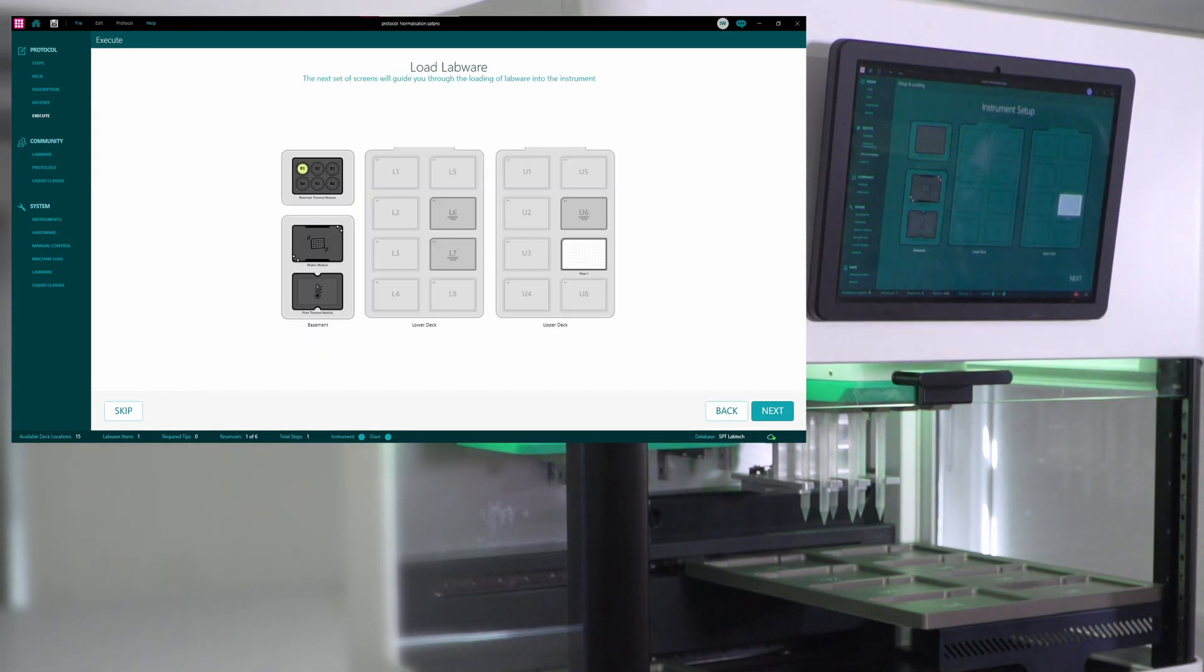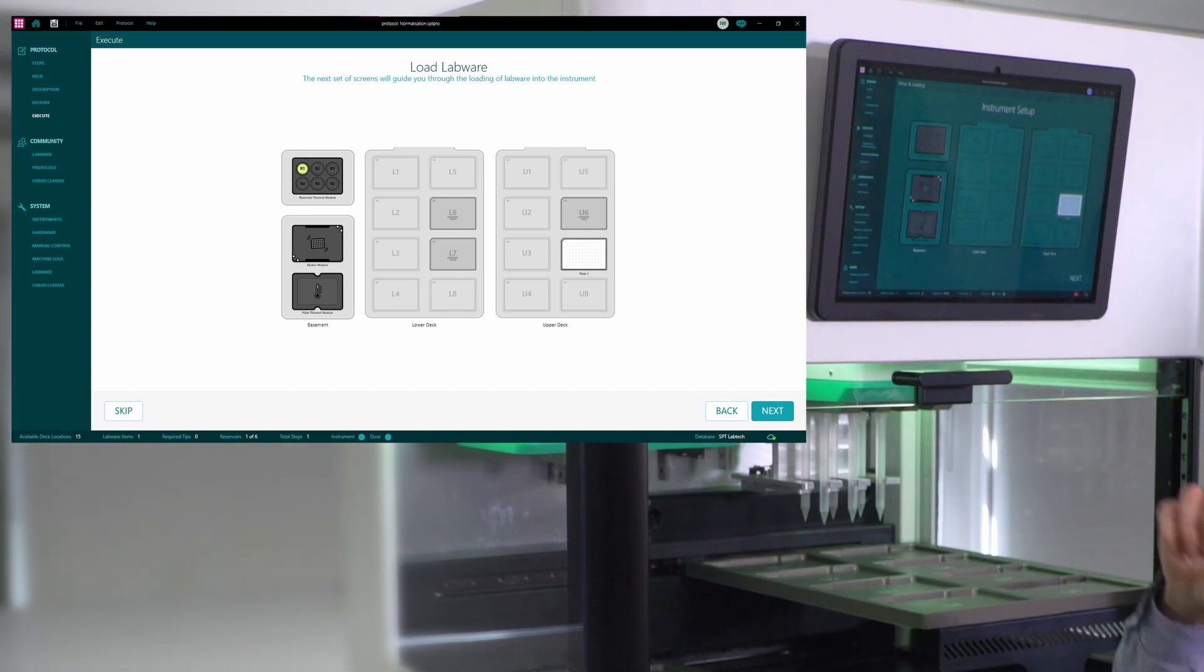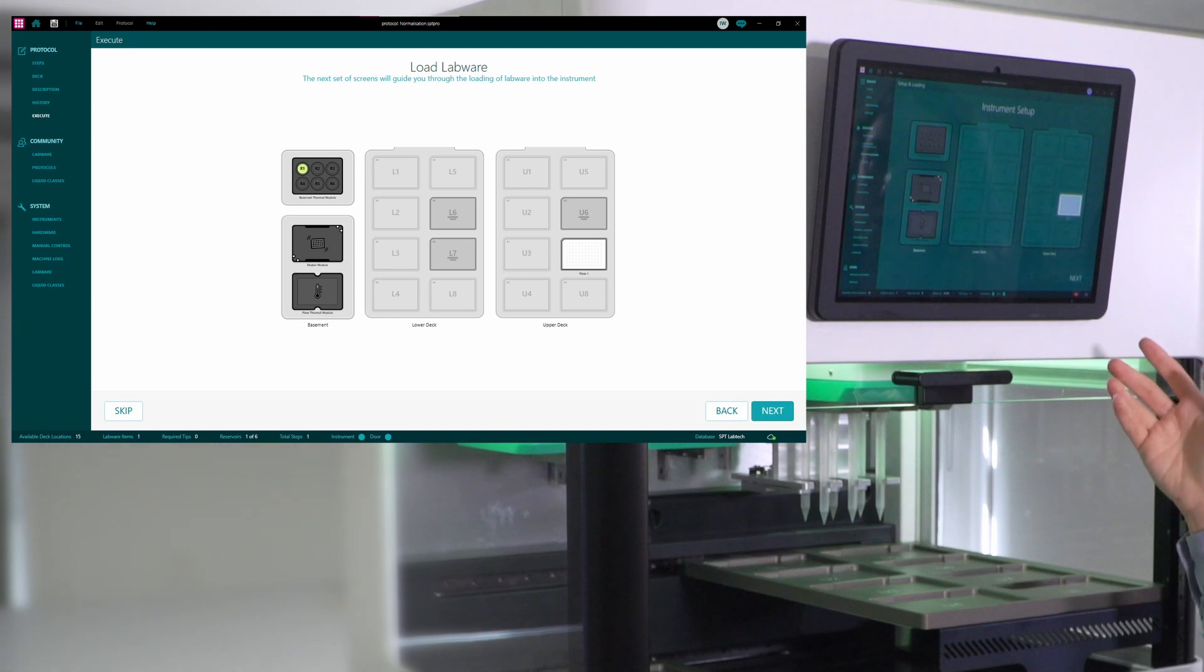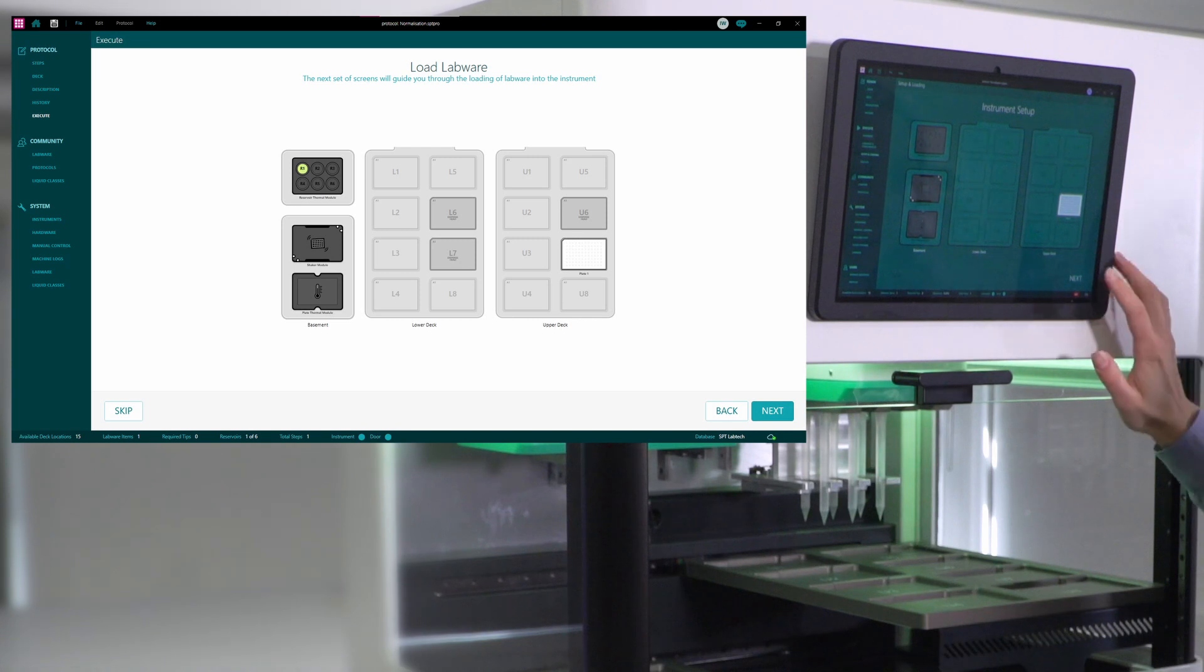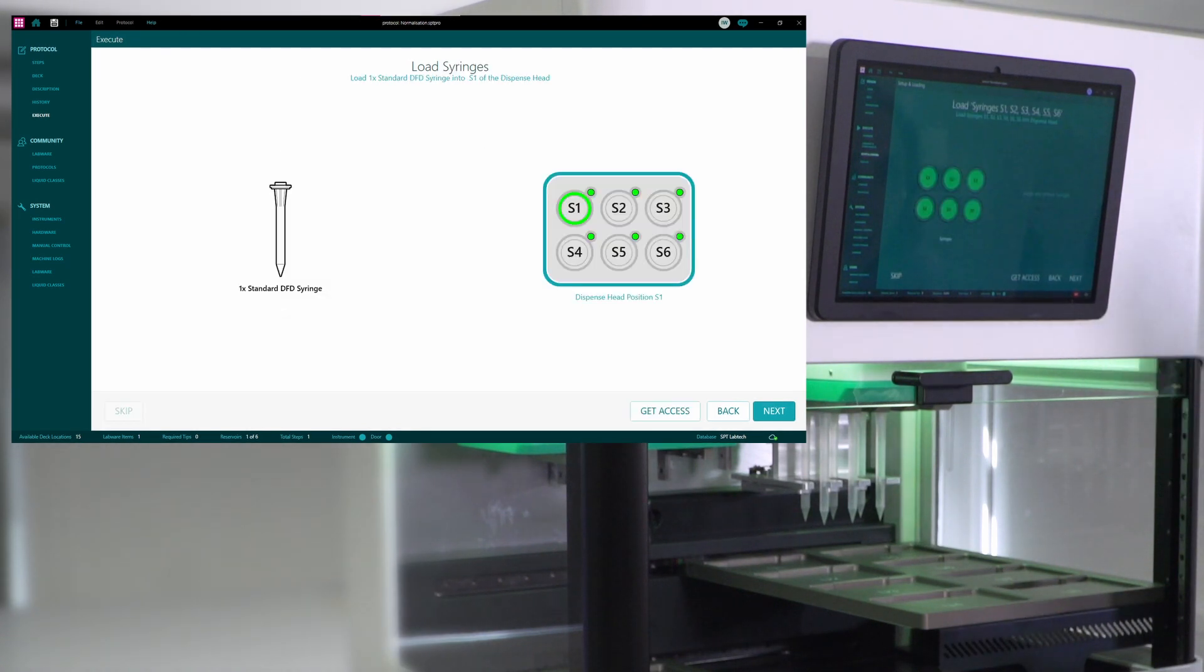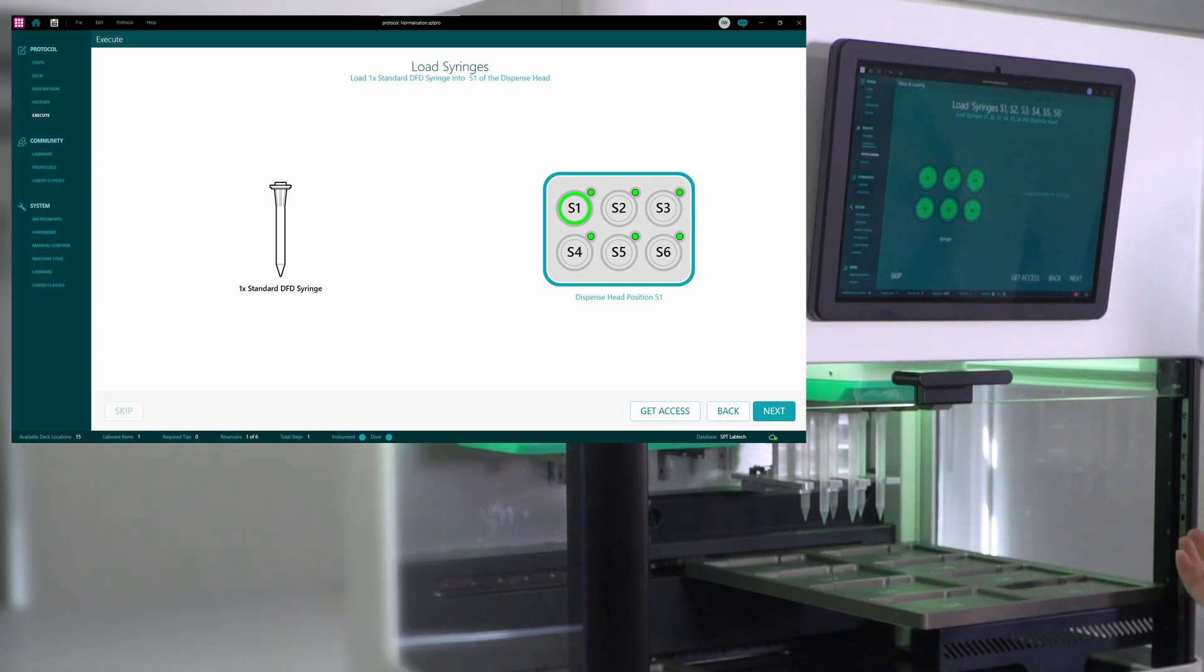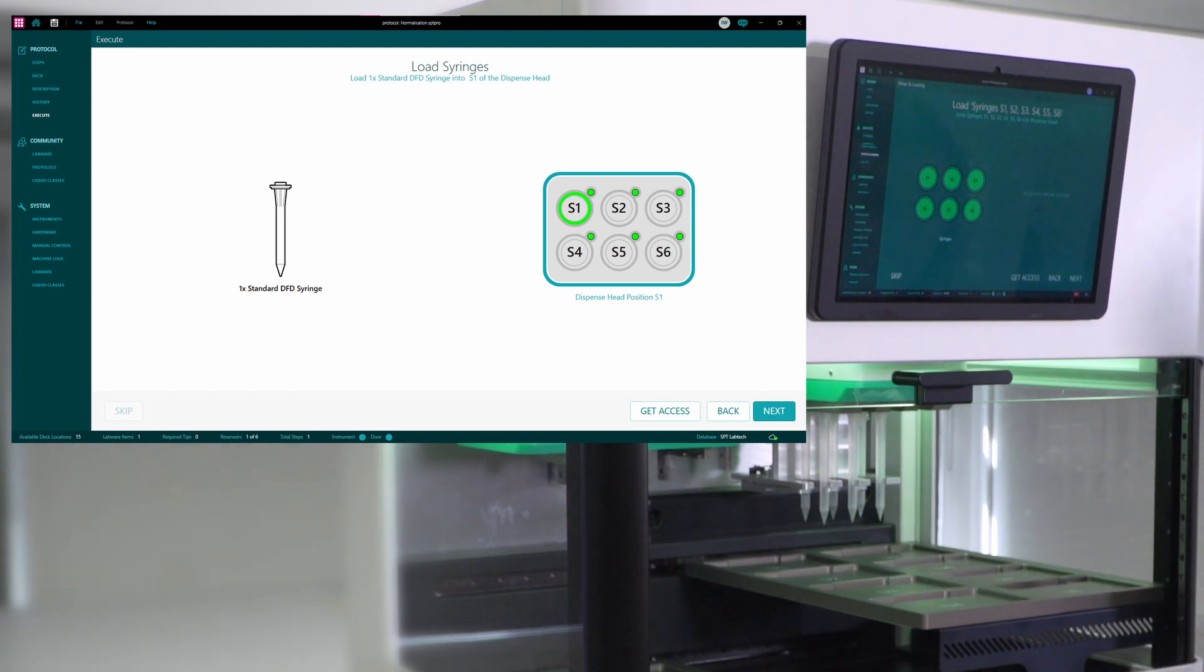And now that I know that I have all the components I need, I can start doing the setup in setup and loading. This screen shows the overview of the instrument, the way it would look after I've set it up fully. So if I just go to next, the next screen prompts me to load the syringes that will be required for the protocol. In my case, I've already run this protocol, so I have the syringes loaded.